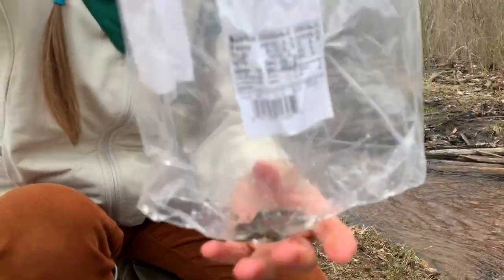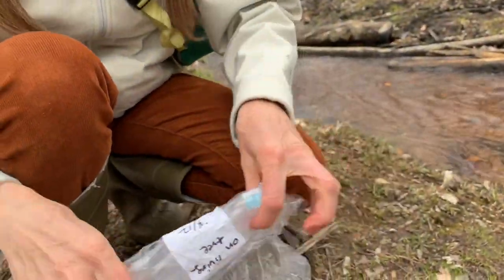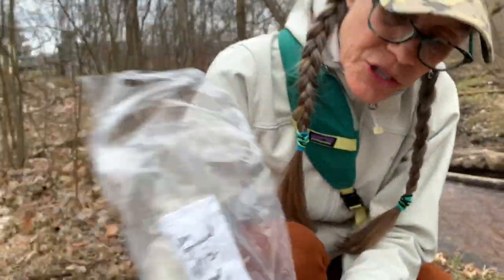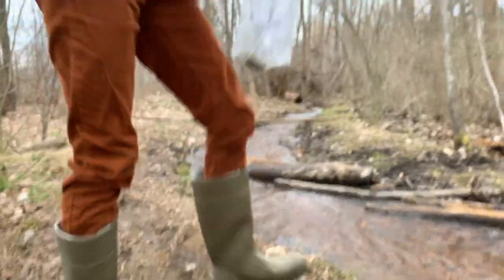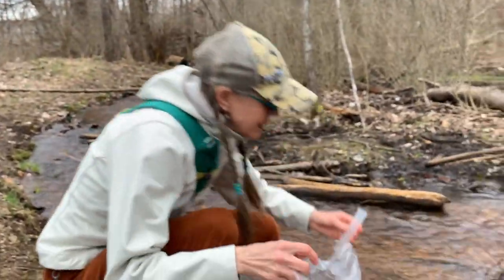And what I want to do next is just gently shake the bags to make sure that all the lichen and all the moss get wet. And I probably have more moss than I actually need for this sample. Since I have such a large amount, I'm actually going to add just a little more water to that to make sure that my moss is good and wet.